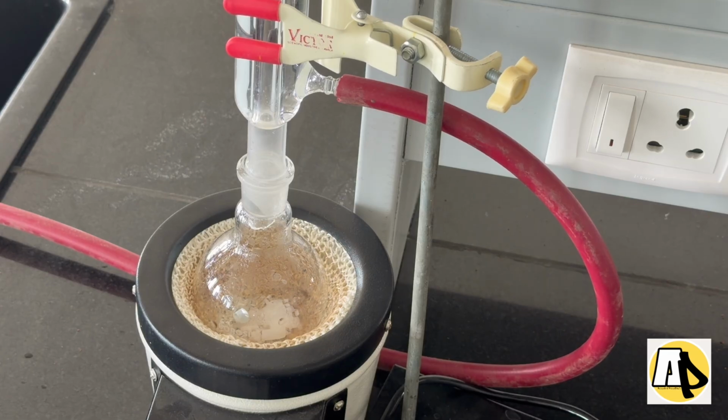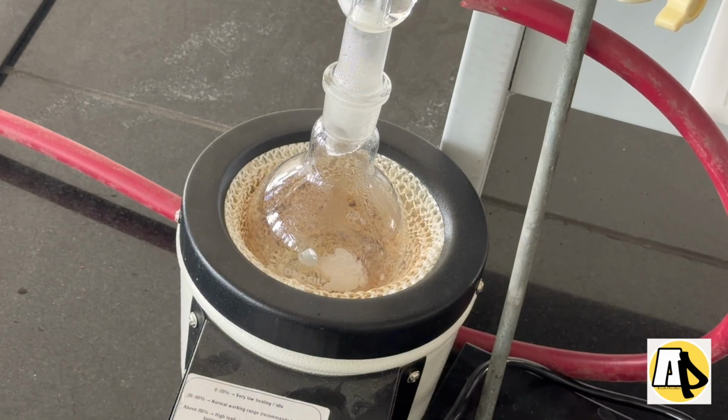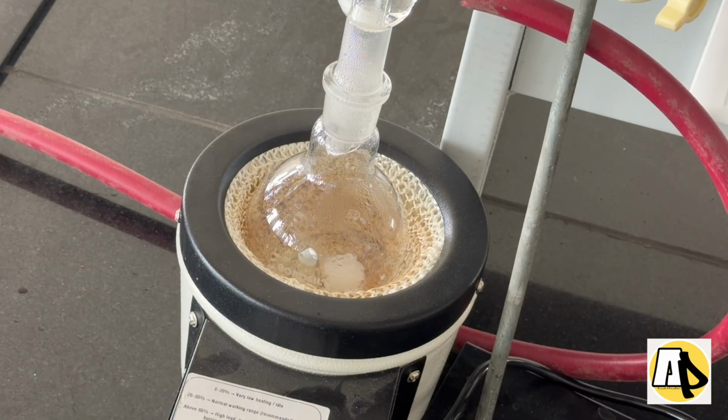Hopefully the experiment will come good. So now you can see the refluxing is happening a little faster. So in no time you can see all the methyl salicylate will get miscible in sodium hydroxide and sodium salicylate is formed. And you might wonder how do you identify the complete formation of sodium salicylate?